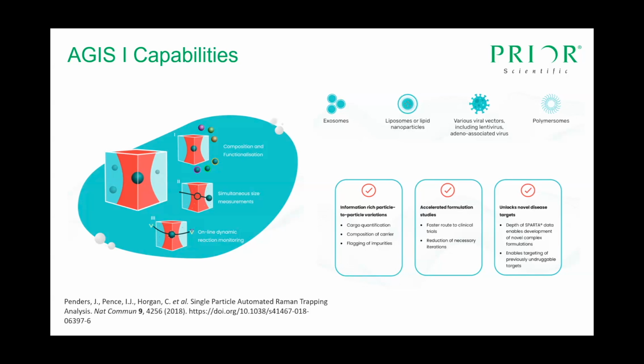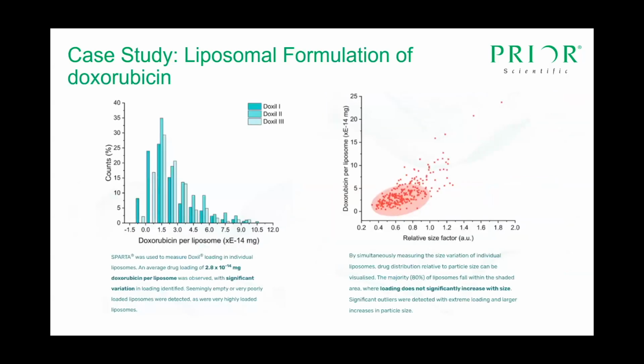And then just an example of how they've been able to use that kind of multifaceted approach to analysis in a really interesting way is that when formulating new drugs, a key factor in the design is how it's going to be delivered. Typically, analysis of how much drug is released in a system relies on a bulk measurement that requires you to effectively destroy the method of delivery and then analyze the total amount of cargo at a macroscopic scale.